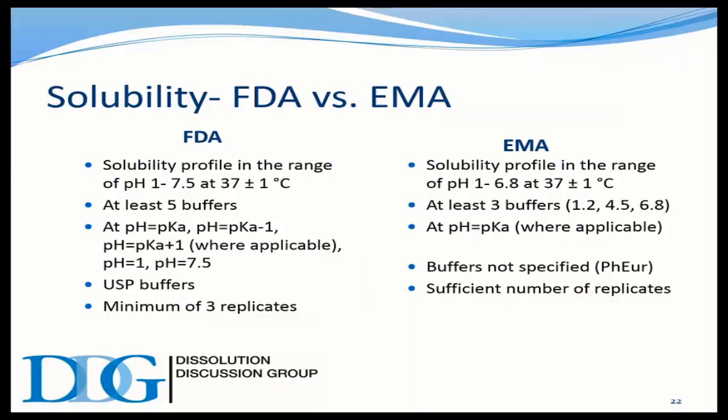In talking about solubility, even regulatory agencies are in, I'd say, common agreement, but as far as the specifics, you may see differences. I think EMEA is the way a lot of thinking was here. You typically use about 3 or 4 different points to prove solubility, demonstrating that range from pH 1.2 on up through 6.8, with 4.5 being a midpoint.